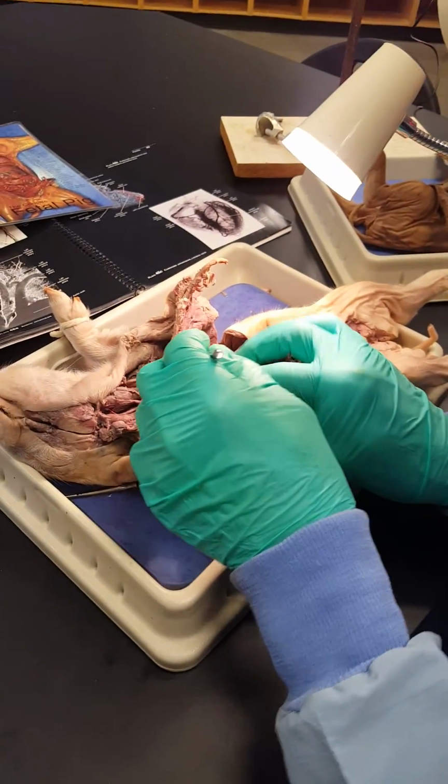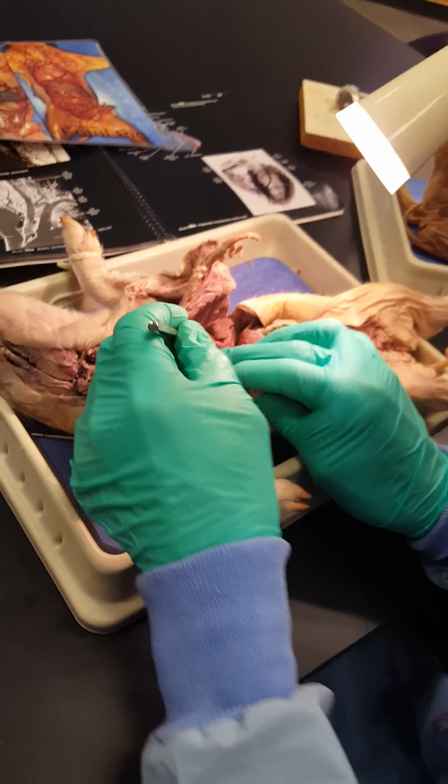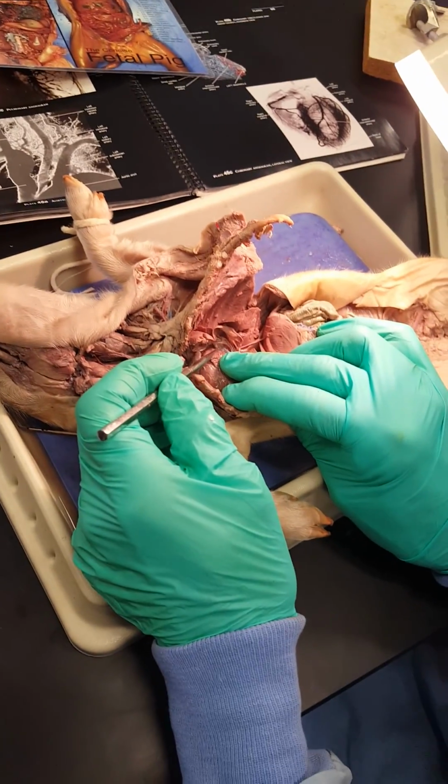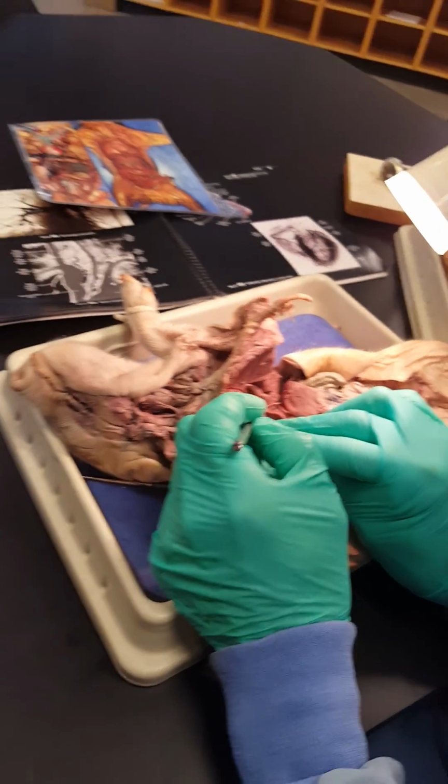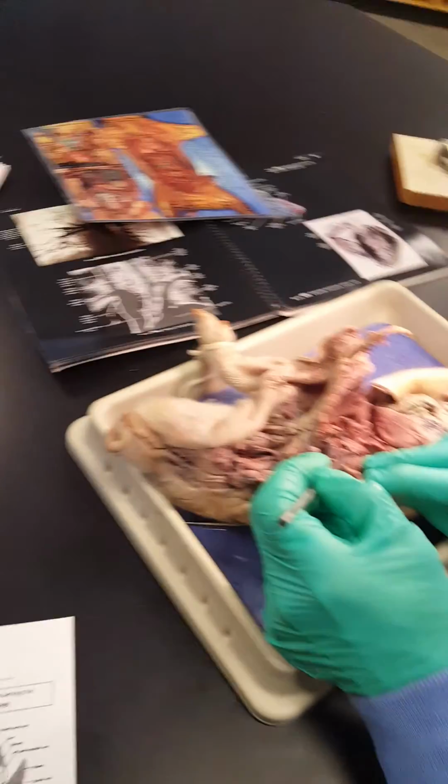The blood from the lungs will return via pulmonary veins, and you can see one of them here. Pretty thin walled, you can see the blue right through it. Into the left atrium, which also has auricles.